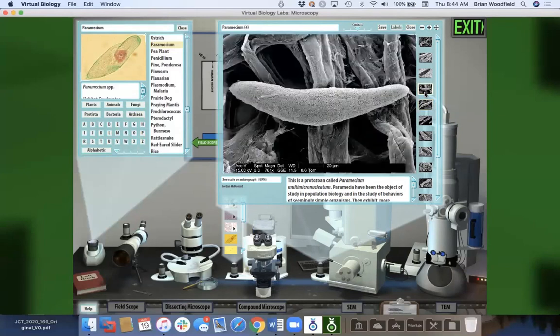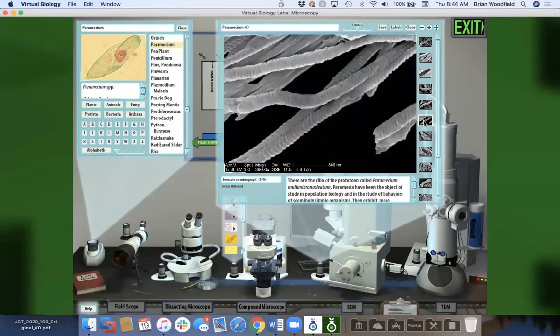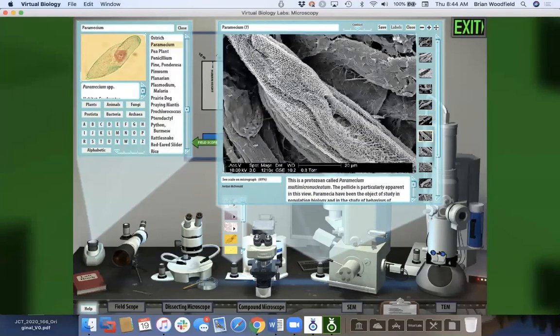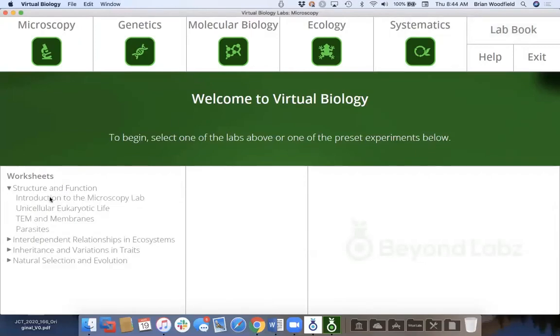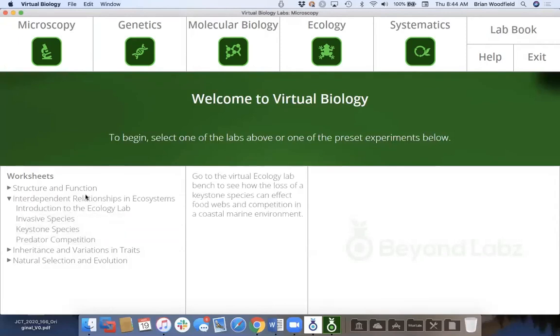So to me, as a non-biologist, I just think this is so amazingly cool to see this kind of resolution and then see which tool is used for the right thing. So we have worksheets that use this to talk about microscopy and how to use it and the different pieces of information. So we have a database of about 3,500 images that they use. So this is our high school version. So all of our worksheets that we have for this are organized by NGSS.